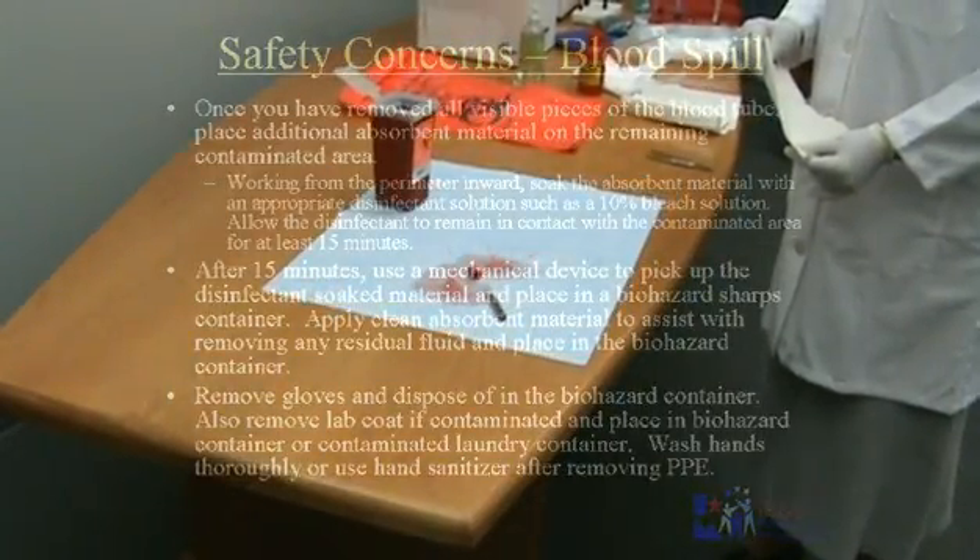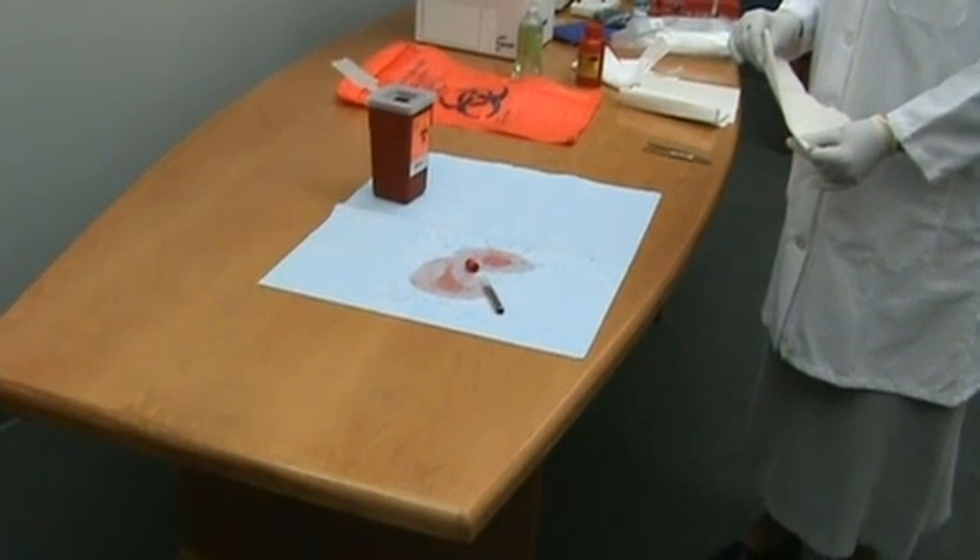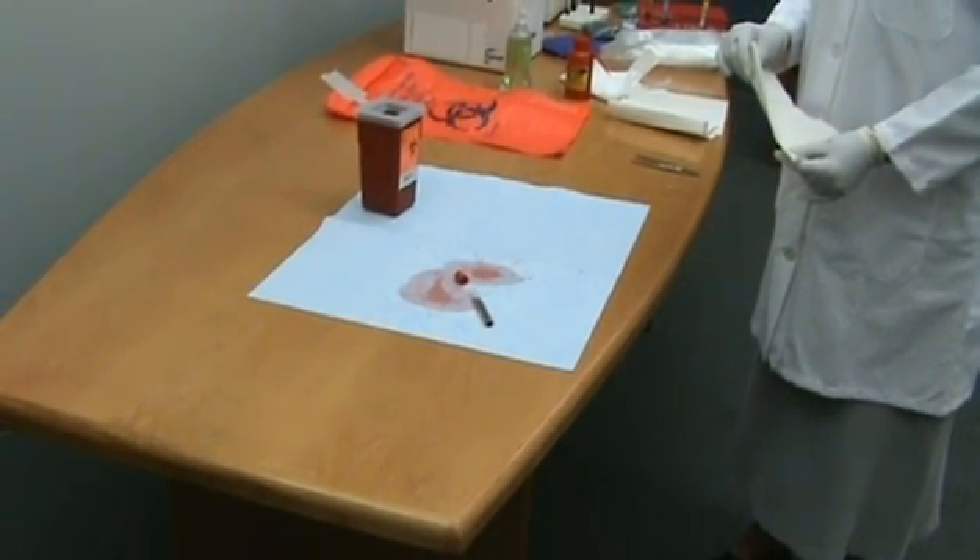When a spill occurs, immediately remove any contaminated PPE and place it in a biohazard container. Inform others in the immediate area about the spill and retrieve your spill kit.